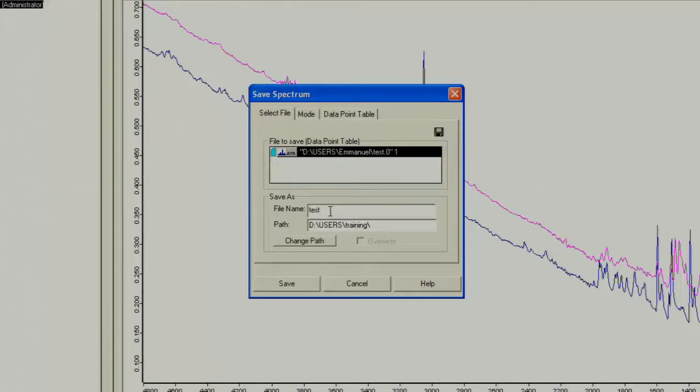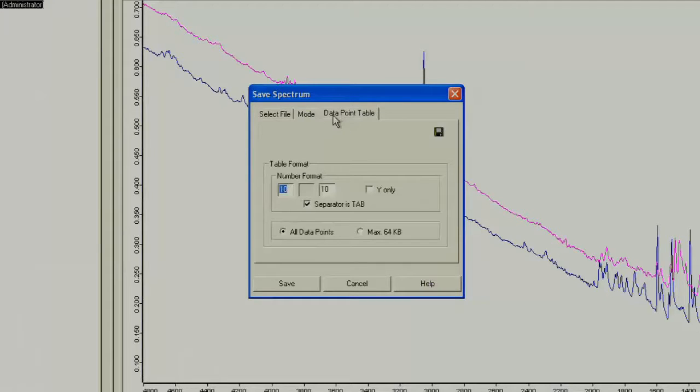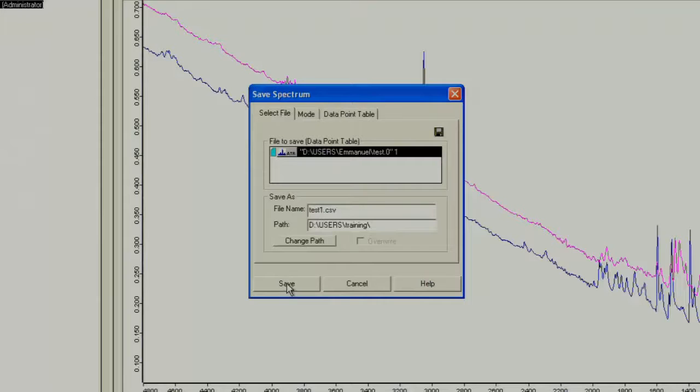Make sure you're saving it to the correct folder. Then click the mode tab, and make sure data point table is selected. Then in the data point table tab, change the separator from a tab to a comma. This will allow you to open the file as a CSV in Microsoft Excel. And then finally, click save.